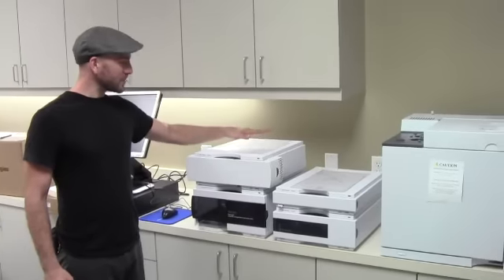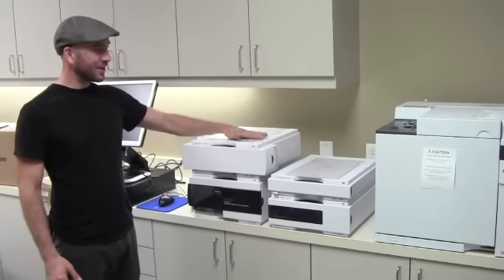Nice. High performance liquid chromatograph — these are like geek wet dreams right here.